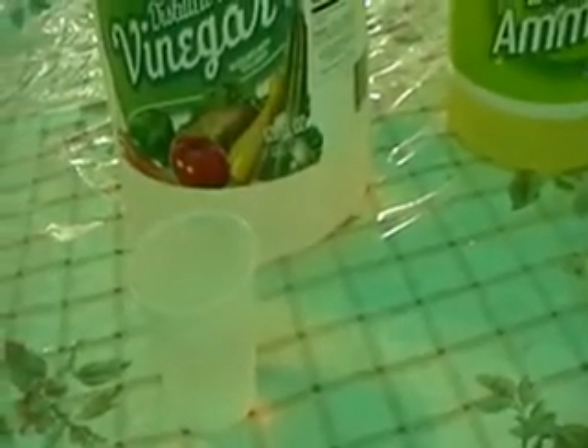Of course, ammonia is never pleasant to smell and neither is vinegar, but at least those are safe for your kitchen glassware — but phenol red isn't.